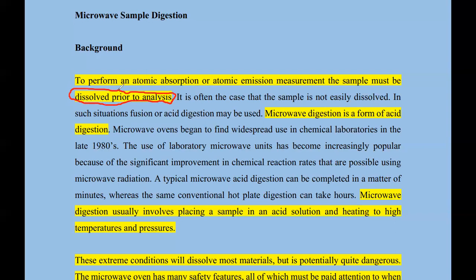Of course, there are some methods, like different types of chromatography, where you can analyze even a sample in the gaseous state. But for atomic absorption spectroscopy, as well as atomic emission spectroscopic methods, you have to make sure that the sample is dissolved.